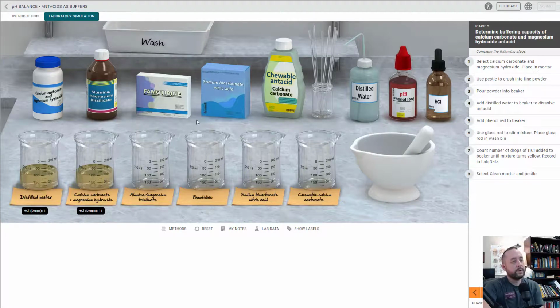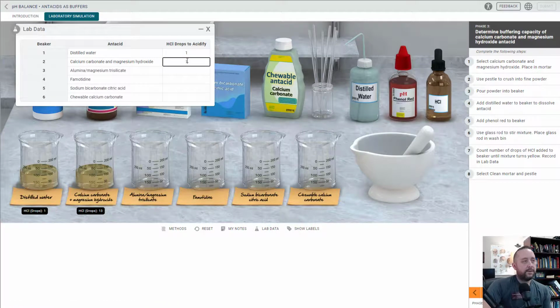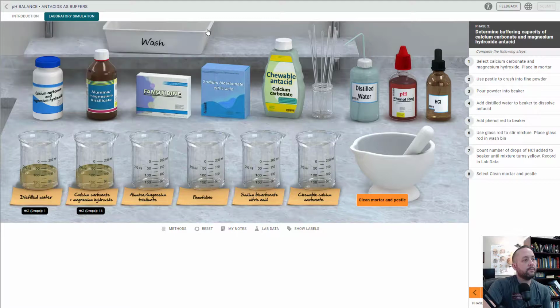Oh no, I was looking away, reading the steps while I was adding. So was it 12 or 13? I'm going to add 13. Lucky 13. Okay, and you'll complete that until you're done. Okay, mortar and pestle's clean. And that's it.